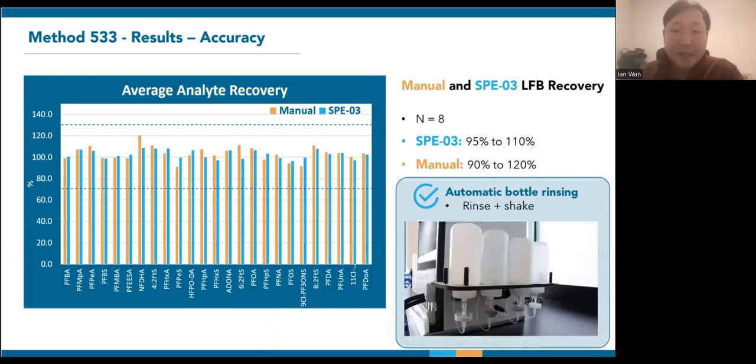Like all PFAS methods, 533 requires multiple bottle rinsing steps to recover compounds that stick to the sample bottles. The SPE03 comes with a bottle rinsing option that shoots a jet of solvent into the bottles and shakes them to distribute the rinse. Here's a clip demonstrating how that works. So, with uniform flow rates and thorough bottle rinsing, we expect optimal recoveries using the automated system.